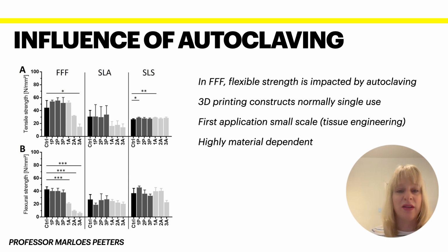But what they did find in this particular case, they looked at a small scale application, particularly for tissue engineering, where you are mostly working with disposable systems. This is where 3D printing might find its niche application. However, until now, this is far more common in a lab environment, where we, for instance, also employed this, compared to use in industry.